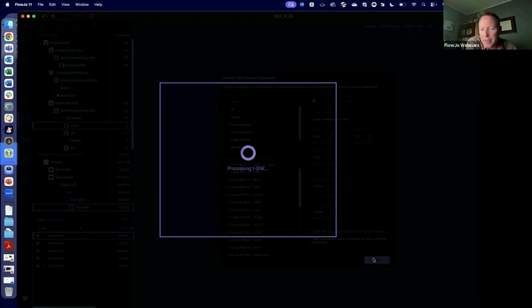Oh, I left exact on. I generally favor using the approximate as it's a little bit quicker than doing the exact measurement between every couple of cells. I was thinking in my practice run, this went a lot quicker. That's the difference.